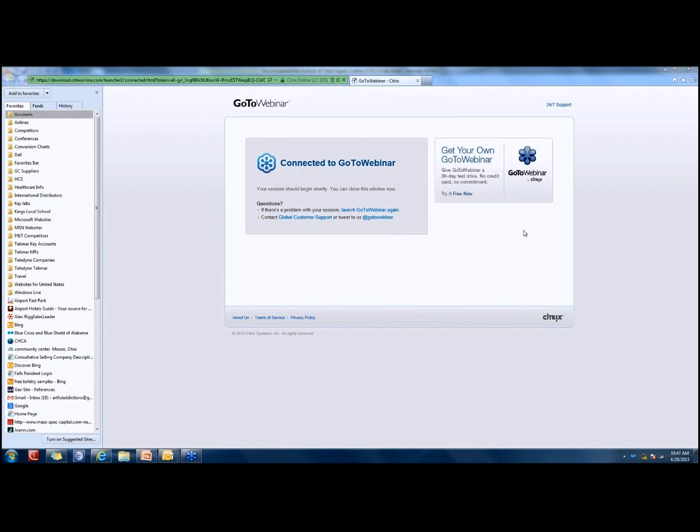We know that the larger sphere catalyst is giving us better results for now, but it's too soon to tell. In most cases, with most systems, you would buy some type of saltwater kit, so it's tough to answer that right now.